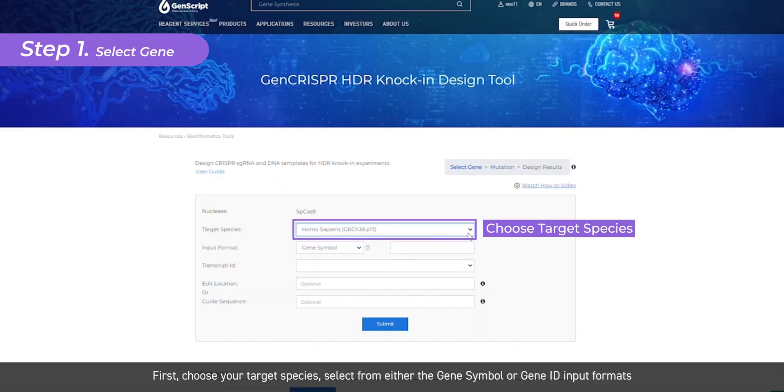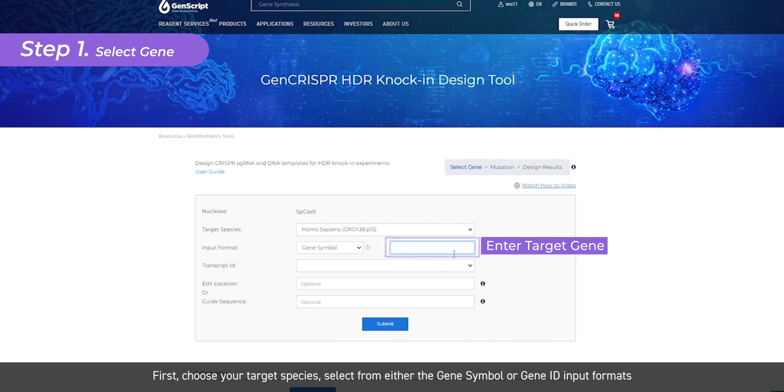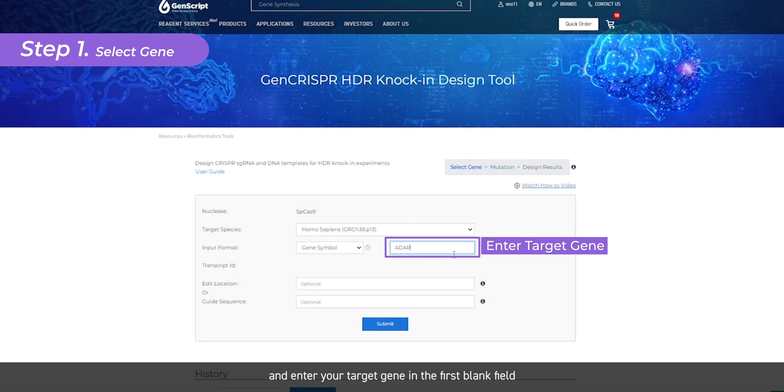First, choose your target species, select from either the gene symbol or gene ID input formats, and enter your target gene in the first blank field.